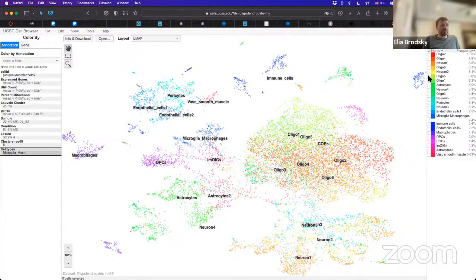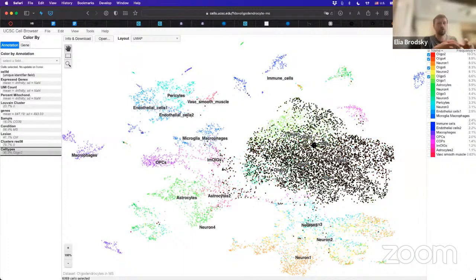But some of these other types, which are probably the majority of the cells, start to be more spread out and more complex, right? So the more we want to define these specific cells, we can group them into larger collections of different subtypes, but also within each larger group, we will find more and more specific trends and patterns.